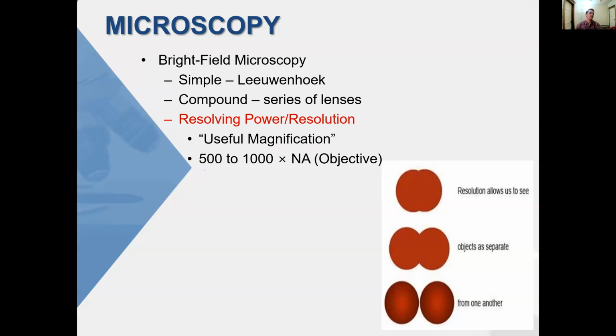In order to observe a specimen with fine details in an optical microscope, the minute features present must be sufficient to contrast and project an intermediate image at an angle that is somewhat larger than the angular resolving power of the human eye. So at a selected numerical aperture, when the microscope provides a magnified image that has a magnitude equal to the resolution limit of the human eye, additional magnification beyond this point does not result in resolving even smaller specimen detail.